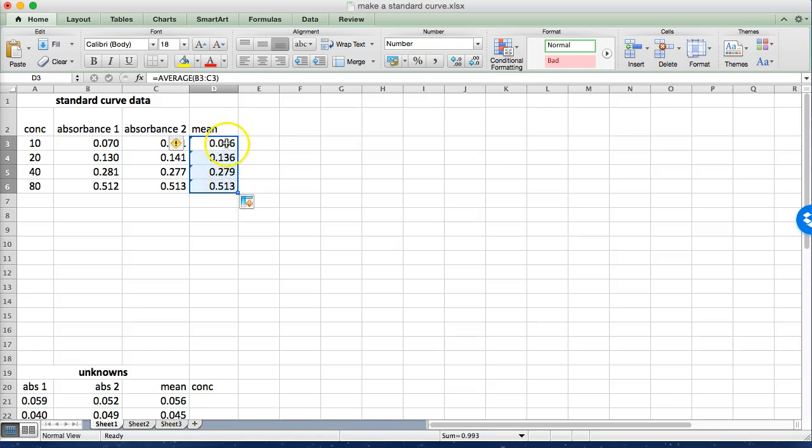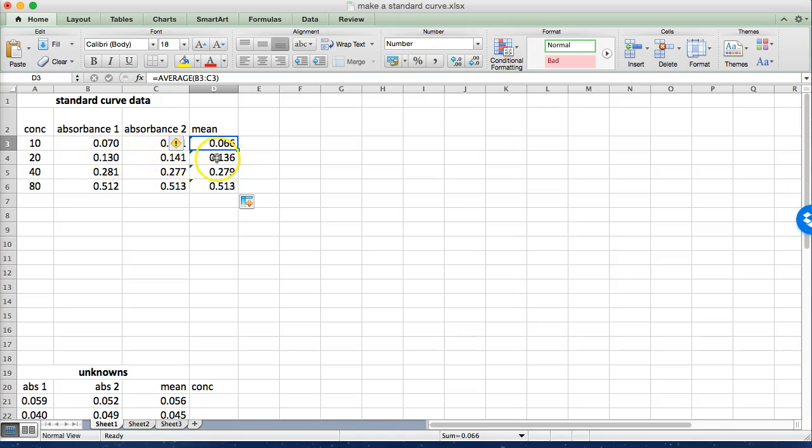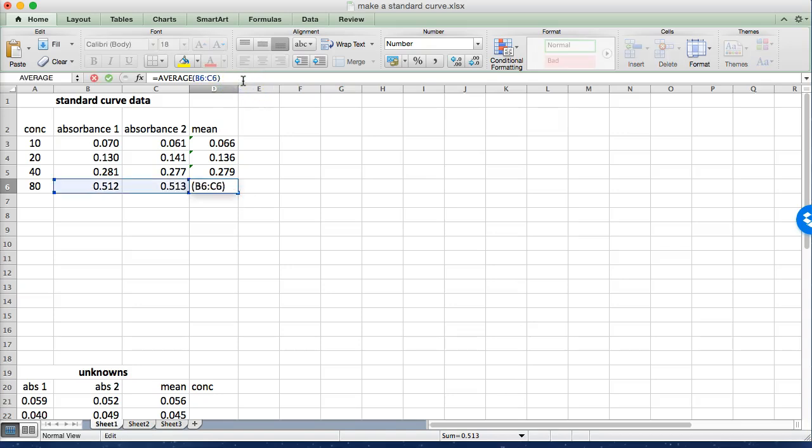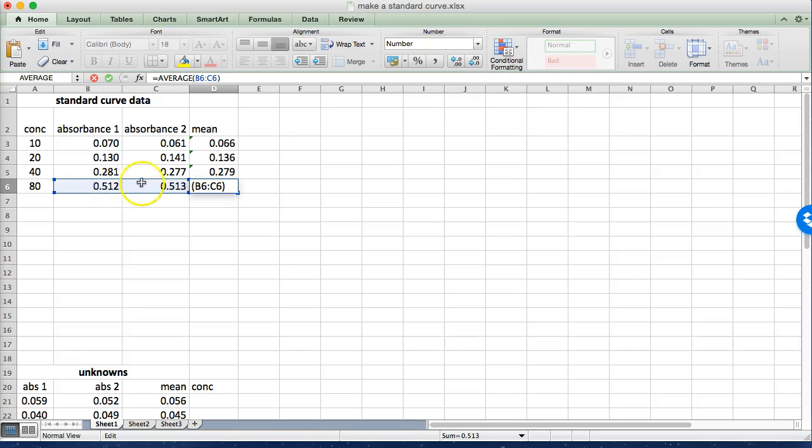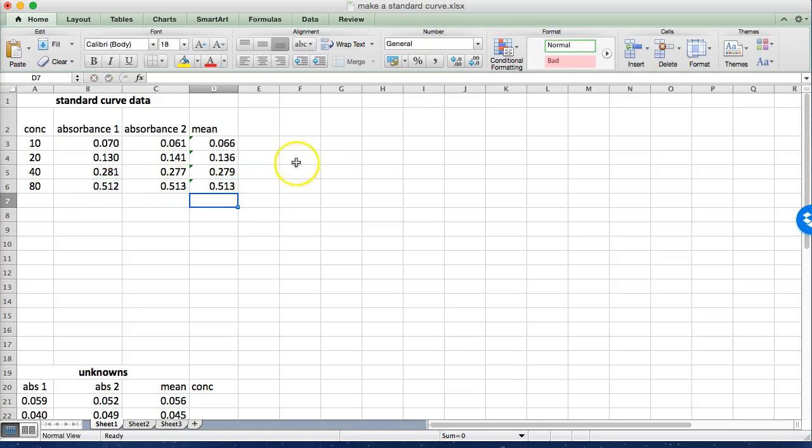Now what Excel's done here is because I used a reference to these two cells for this calculation it's going to assume that I want to do the same reference to the adjacent cells for the other calculations. And I just like to double check and make sure that I dragged properly. If you click on the cell and then go up here and click in what we call the formula bar, you can see that indeed in this very last cell we've used B6 and C6 for the mean so that's exactly what we want.